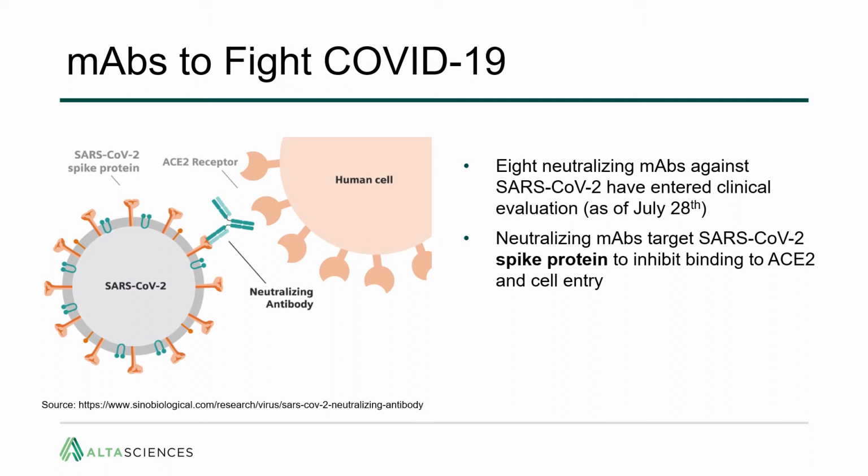As for any other therapies, quantitative bioanalysis plays a central role in the drug approval process, as reliable pharmacokinetic data on drug exposure is required.